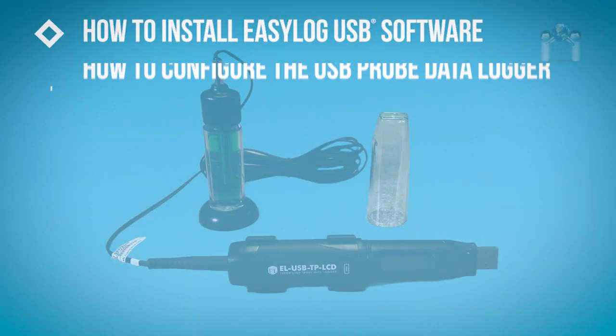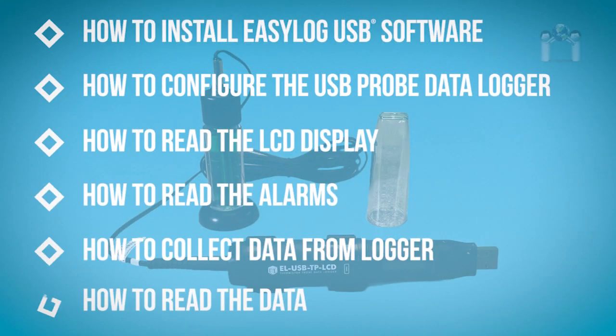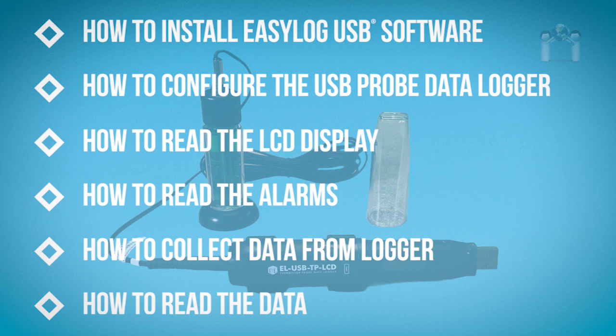In this video I will discuss how to install the EasyLog software, how to configure the data logger, how to read the display and the alarms. I will also demonstrate how to collect and read the data.